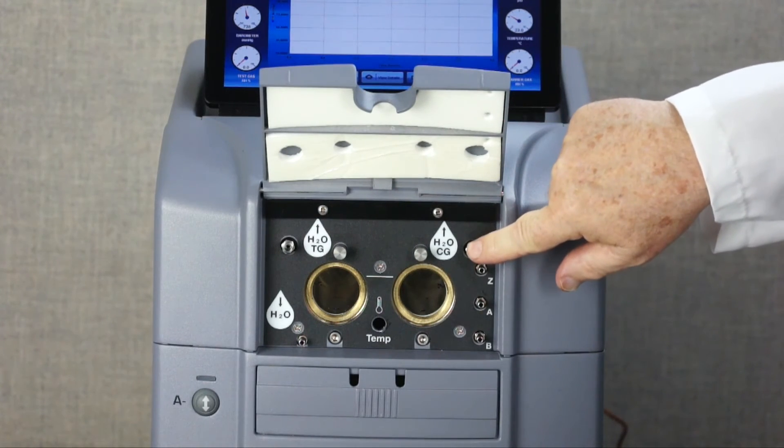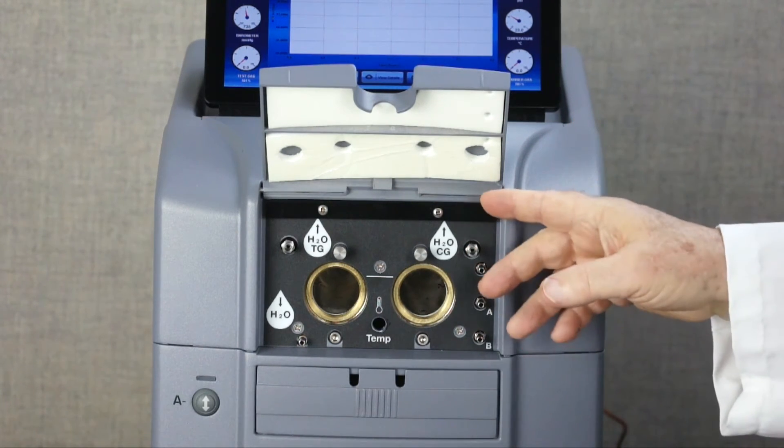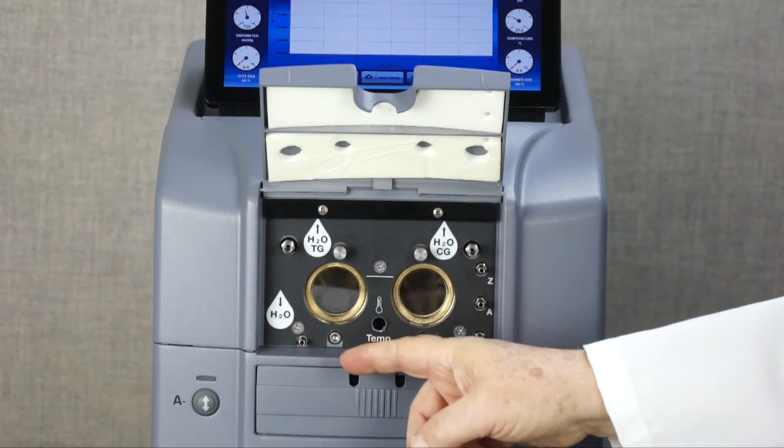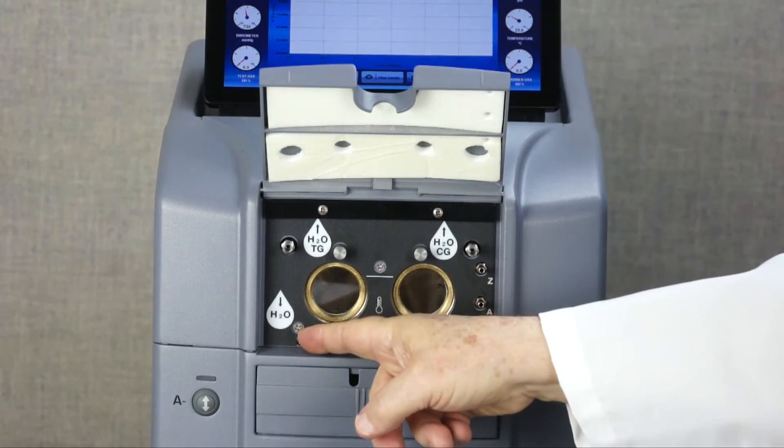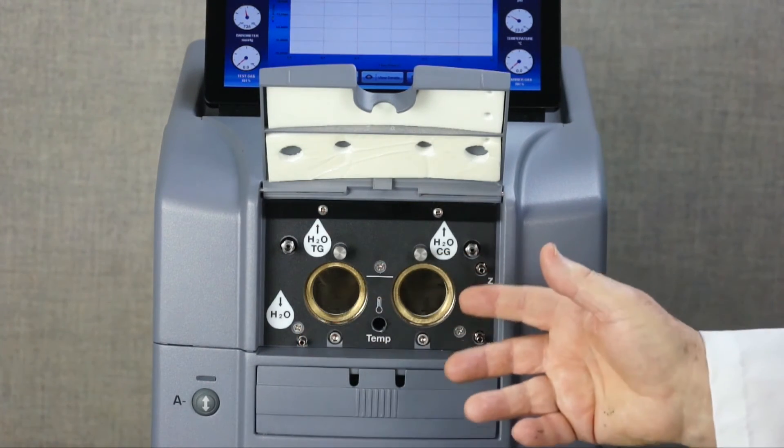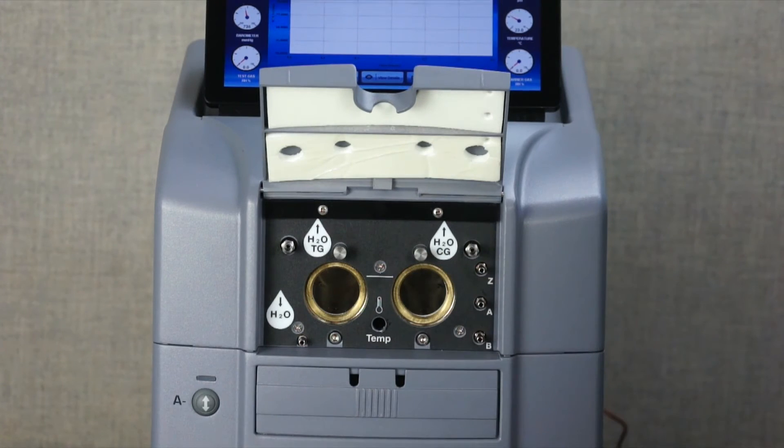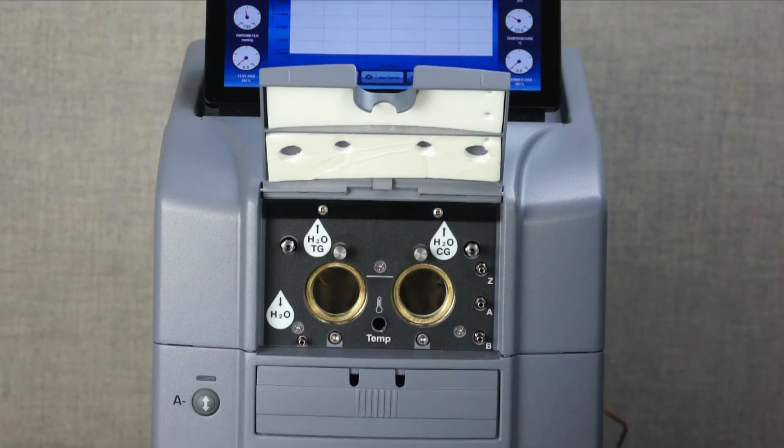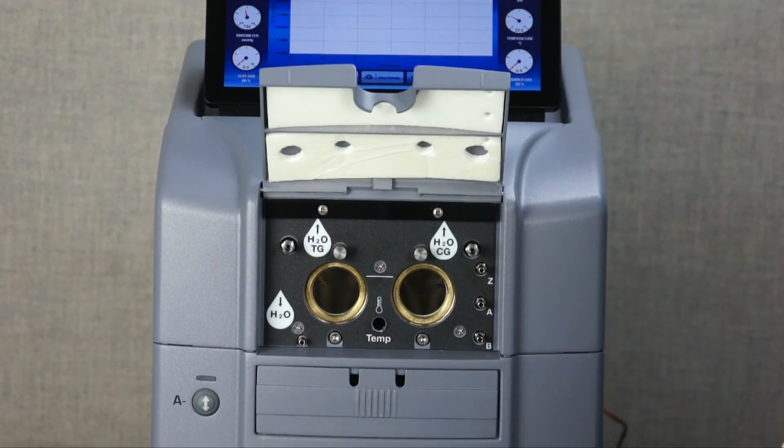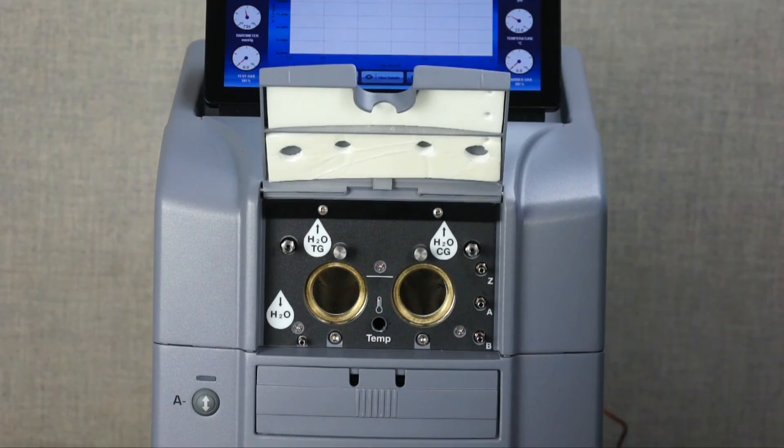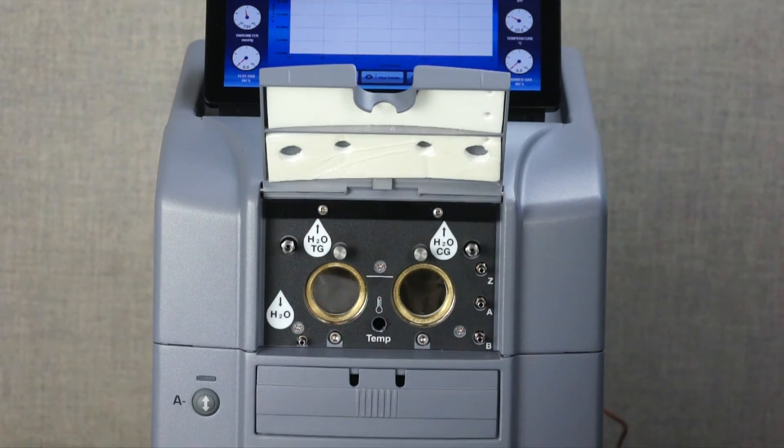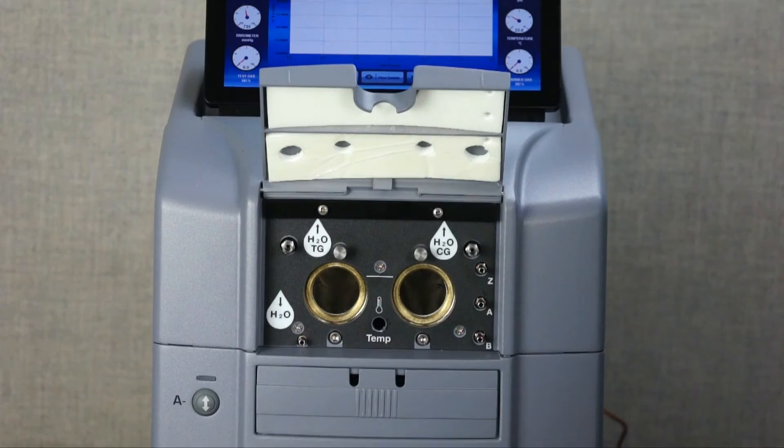For transportation, all water is easily removed through this one port. One time-saving feature of this system is that it will display a warning on the touchscreen if you should set up a test with insufficient water in the reservoir. You can run RH testing over a weekend, confident that sufficient water will be available.